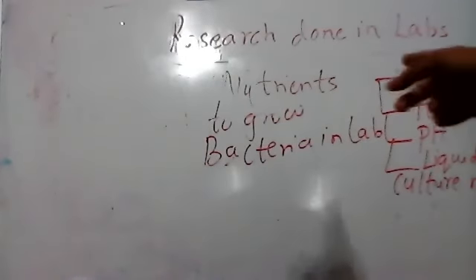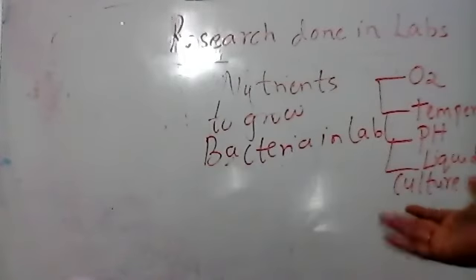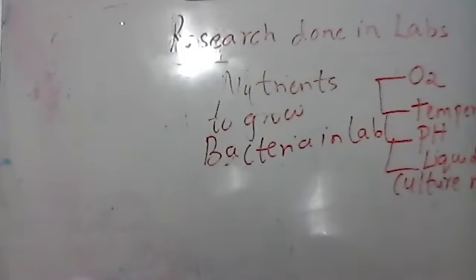It doesn't matter if somebody has an infection; if the food you're preparing in the Petri plate is not correct, your bacteria is never going to grow. The person might have a bacterial infection, but you will get false results. Why? Because bacteria will never grow. Why didn't the bacteria grow when the person had bacteria in his throat? Because your growth media, or the food which you prepared in the Petri plate, was not correct. So the bacteria never grew, right? Bacteria died, it never grew.